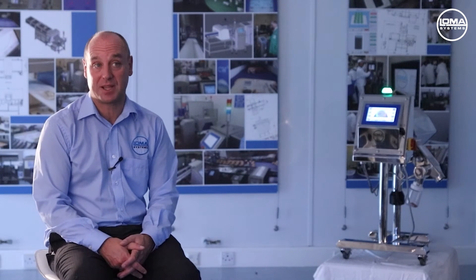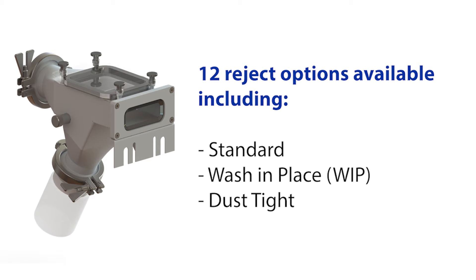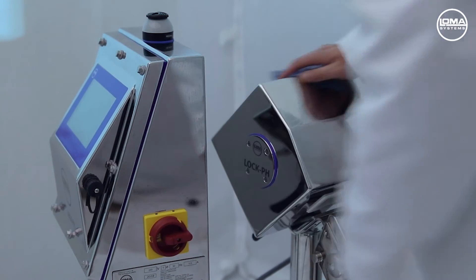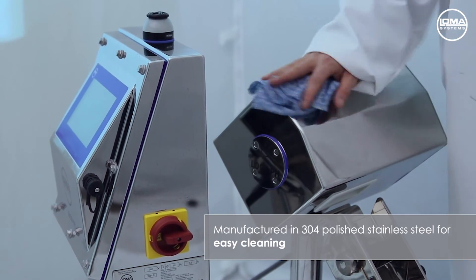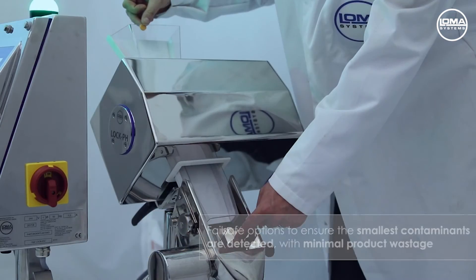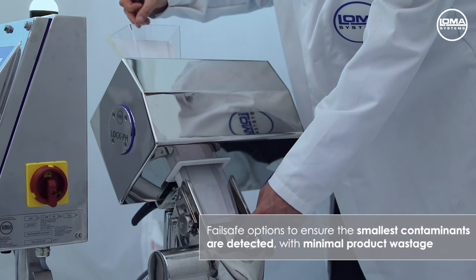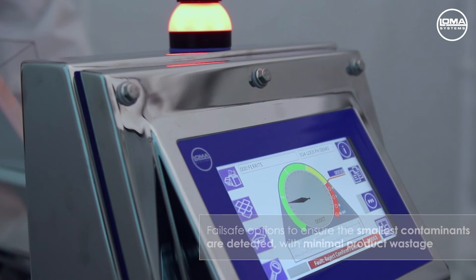The unit has 12 different reject types to suit any application, from our standard lift-flap fail-safe reject to wash-in-place and dust-type applications, all with the appropriate chutes. The machine is manufactured in 304 stainless steel for easy cleaning. All the rejects are manufactured in 316 polished stainless steel, offering a variety of fail-safe options to always ensure that the smallest metal fragments are rejected with minimal product wastage.